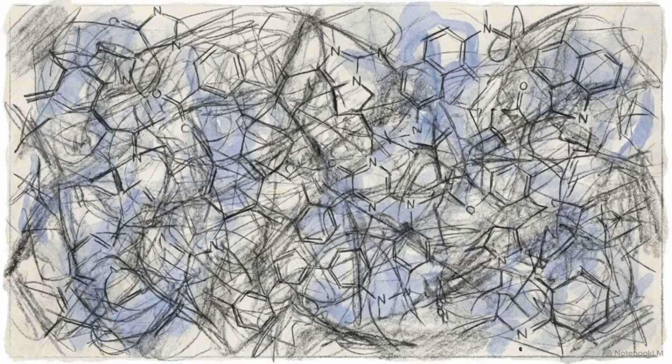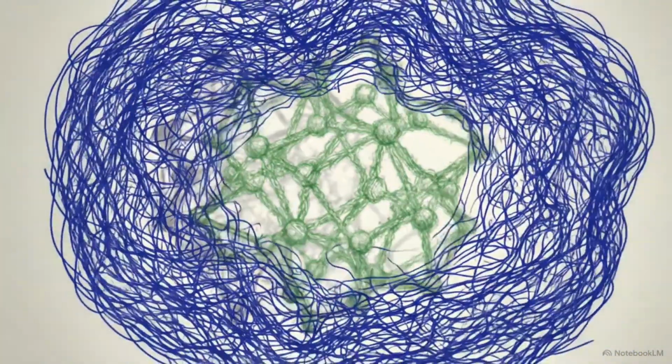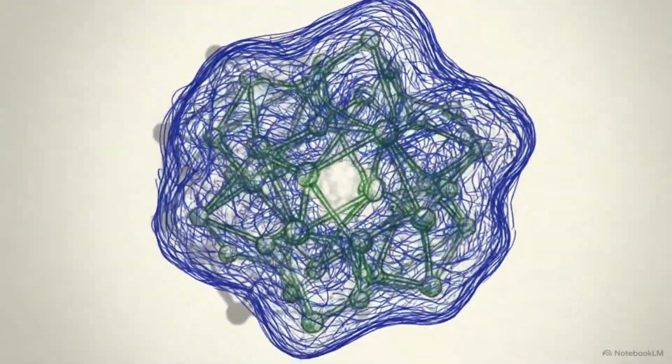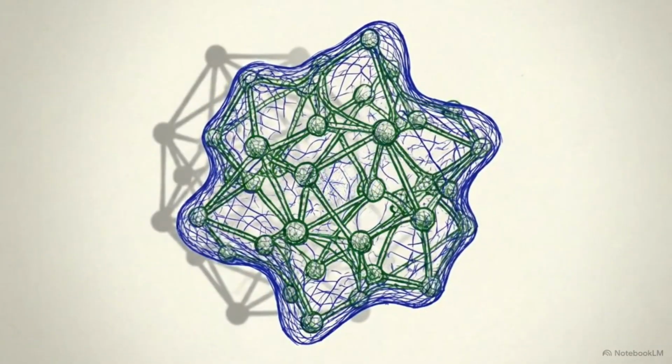If you look at an initial, phase-biased map, the contrast is poor and the layout is deceptive. The false electron density perfectly wraps around the incorrect coordinates of the starting model. It validates the flawed wireframe, while the true structural shadow remains faintly ignored in the background.